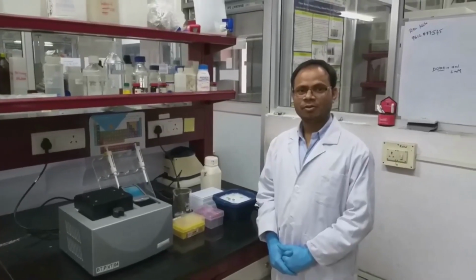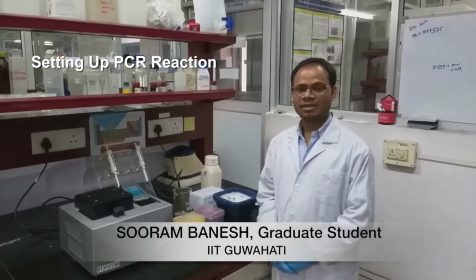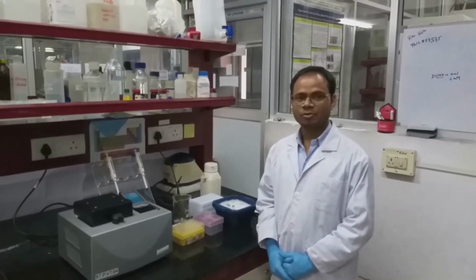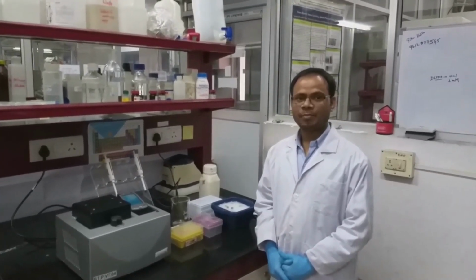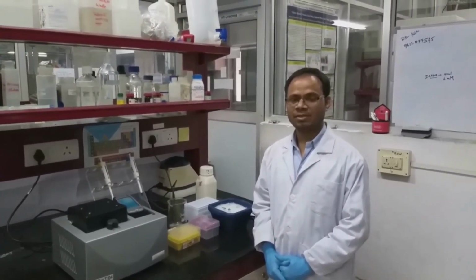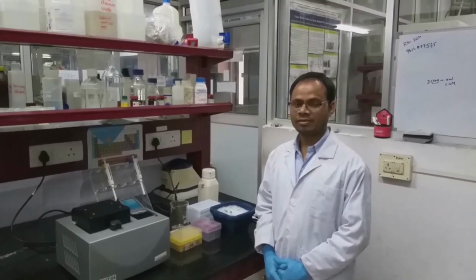In this video, we will be demonstrating how to set up a PCR reaction and analyze the results using agarose gel electrophoresis. PCR, or polymerase chain reaction, is a widely used molecular biology technique to amplify a particular segment of DNA. It is also employed in biomedical research and forensic medicine. The main application of this polymerase chain reaction is cloning.